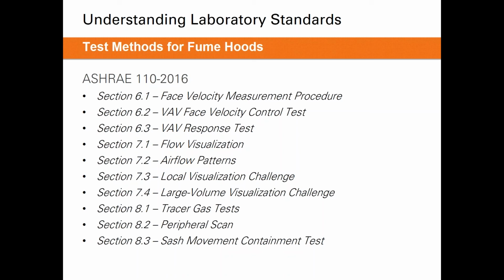So ASHRAE 110, like I mentioned, is very expansive. We will focus today on sections 6.1, 6.2, and 6.3. So we'll be discussing the face velocity measurement procedure, our VAV face velocity control test, and the VAV response test.